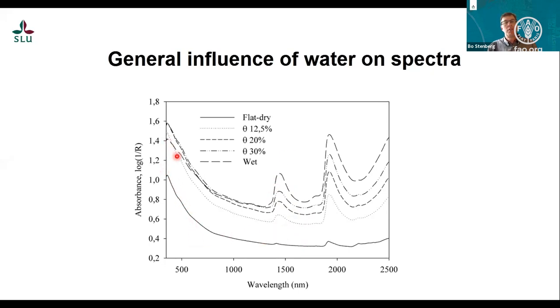While in the visible part of the spectrum, it quite soon stops increasing the absorption. That is because as soon as all the surfaces are covered with water, nothing more will happen. And that's because this is not direct absorption by the water in itself. It's actually more like a diffusion.